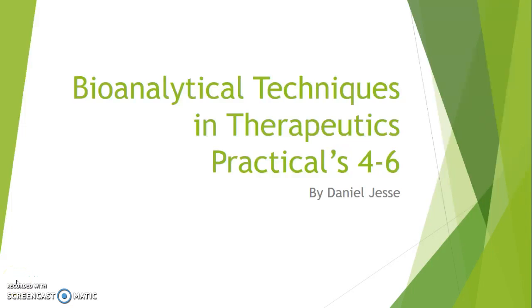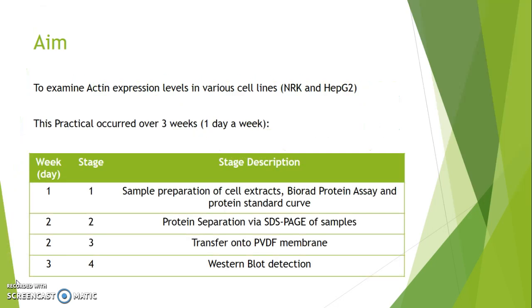Hello, this is my presentation on bioanalytical techniques in therapeutics, practicals 4 to 6. The aim of these experiments was to examine actin expression levels in various cell lines, which were NRK and HepG2.